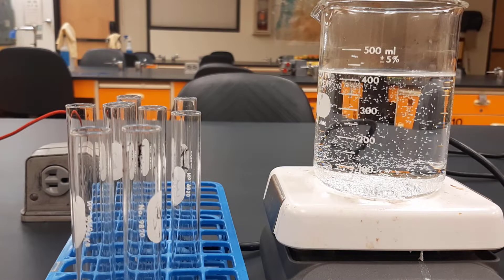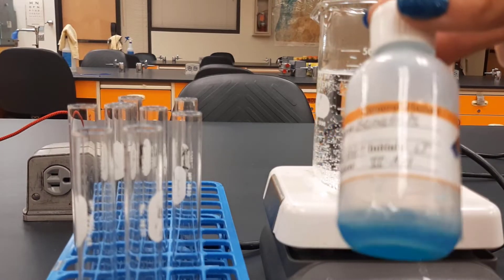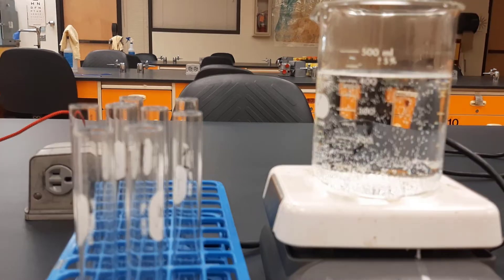All right, let's now run our test for simple sugars. We're going to use Benedict's test, using Benedict's reagent — a test for simple reducing sugars.